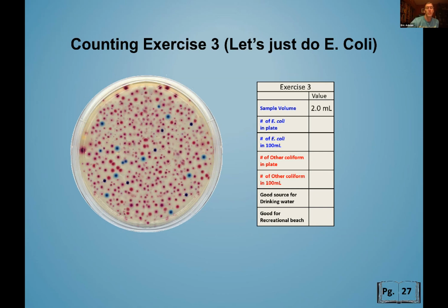Okay, so here's one. They should show the math. You're right. Why 0.5 would then be 1200: it's because you're dividing by 0.5, which is essentially the same as multiplying by 2. But you're right, I should show that math.